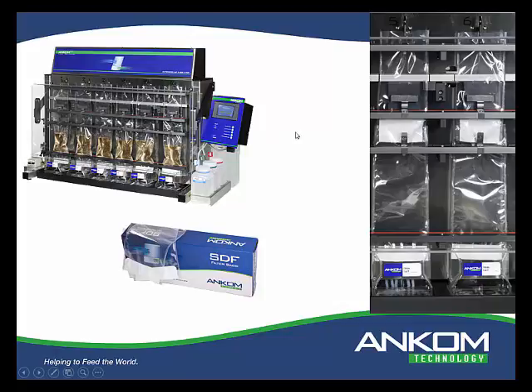On this right-hand side, you'll see perhaps a better close-up showing both the insoluble dietary fiber bag in the upper section here, and the lower one has the SDF bag. So again, separation points, filters, beakers, if you will, on the other part of it. So that's the design there.